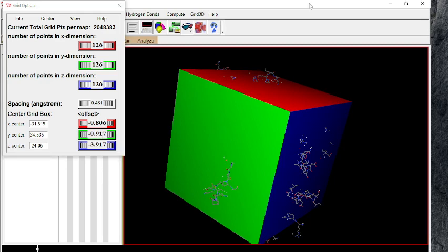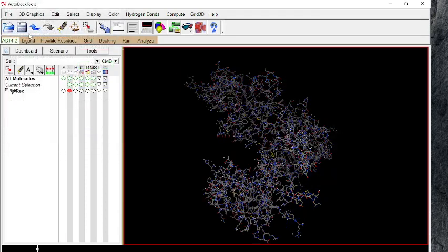After this activity is done, the most important step is to save the grid coordinates. To save the grid coordinates, close saving current. The grid coordinates are now saved. If you forgot to save the grid coordinates, you will need to perform these steps again.